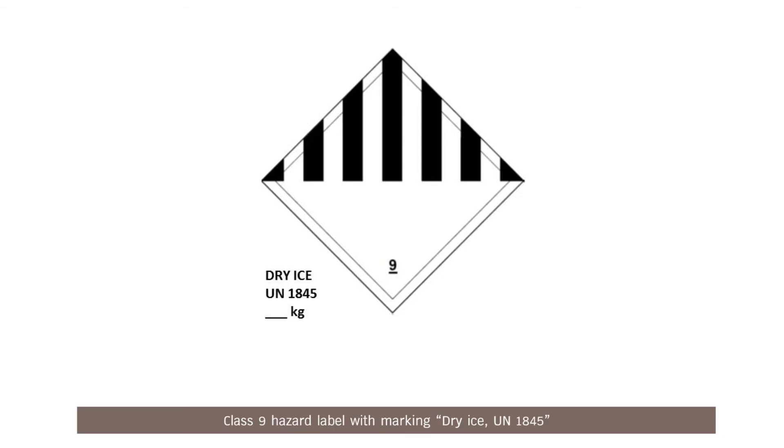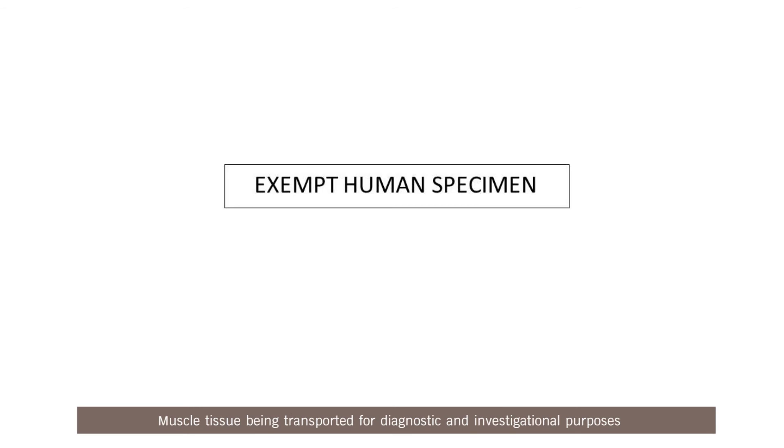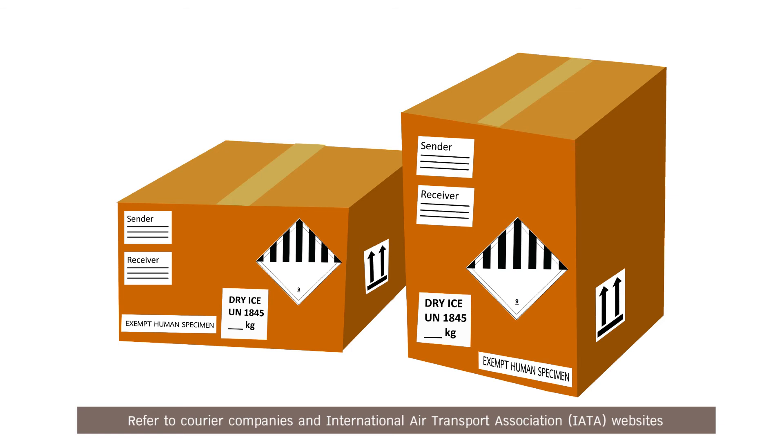Class 9 hazard level with marking, dry ice UN 1845, and net weight of dry ice in kilograms is required for international shipping. Muscle tissue being transported for diagnostic and investigational purposes with the least infectious probability should be labeled as exempt human specimen. Refer to courier companies and the International Air Transport Association (IATA) websites for specific shipment instructions.